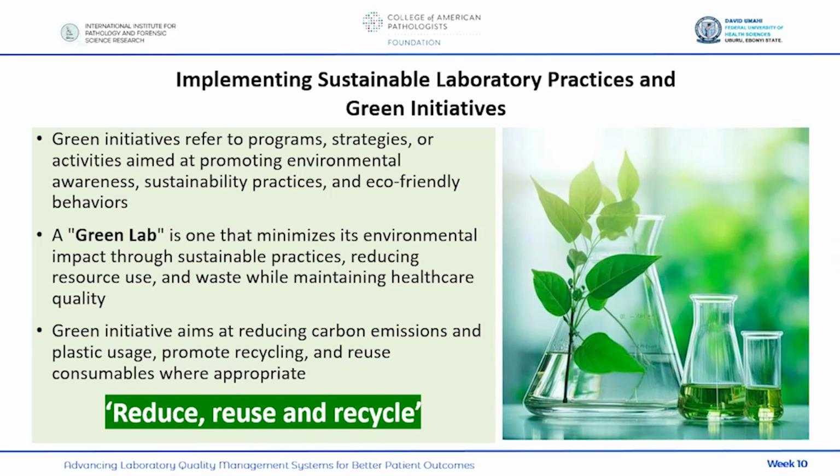not too fast to join. So other sectors have actually moved ahead of the healthcare sector, and the healthcare sector is just coming in. And in the healthcare sector, the laboratory has a very great role to play in keying into green initiatives. So what is a green lab?